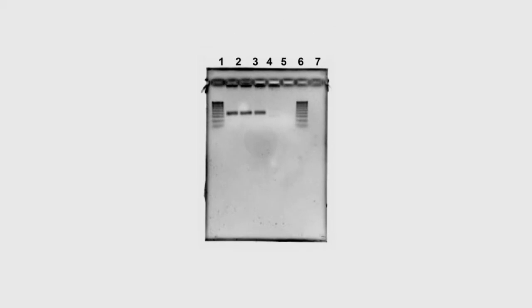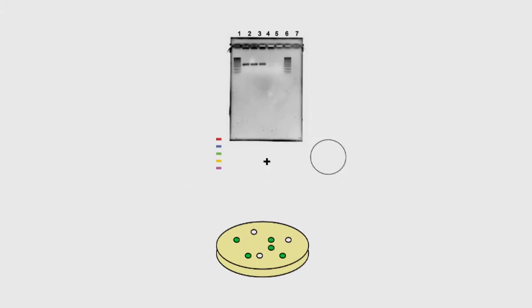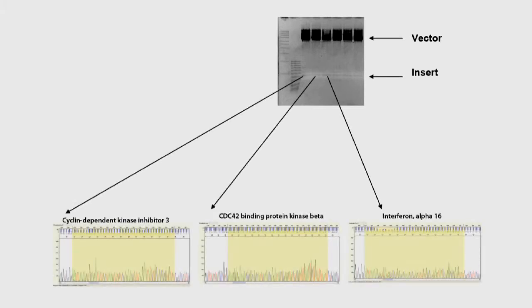As a second step, the shRNA template material is recovered, which enables the deconvolution of the pooled screen. The recovered shRNA is then cloned into the vector and transformed into competent bacteria. Next, plasmid DNA samples are sequenced and shRNA targets are identified using the Lentiplex shRNA sequence search database.